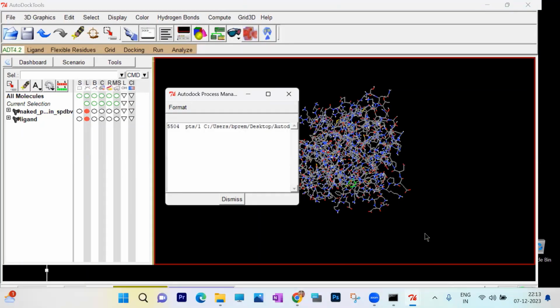Okay. Since the program is running for a few minutes, I hope you will wait. Other tabs I have not used. If you get familiarized with it, you can run AutoDock Vina in the same way. You can analyze AutoDock Vina also, where you will be using multiple ligands. In the next part of the video, we'll use PyRx, and we'll be using EasyDockVina in the third part. The first part will go for single ligand docking with this.